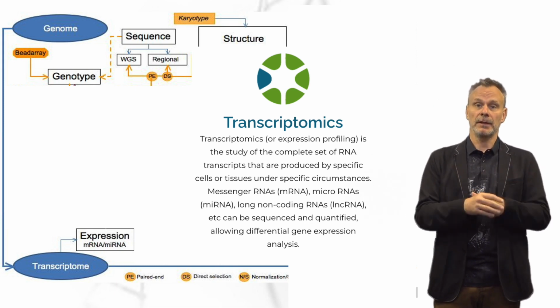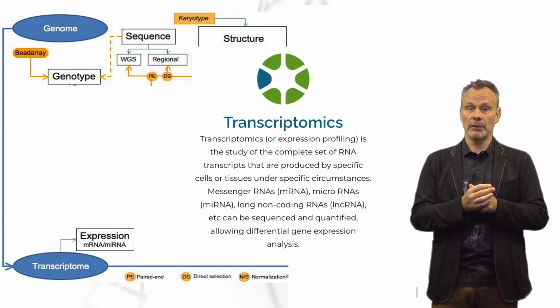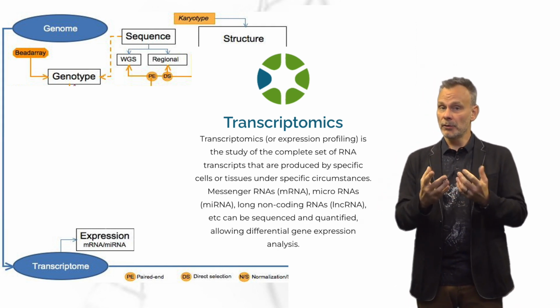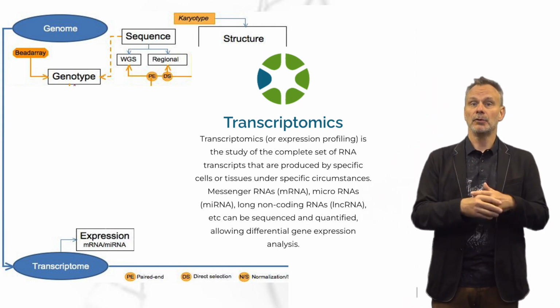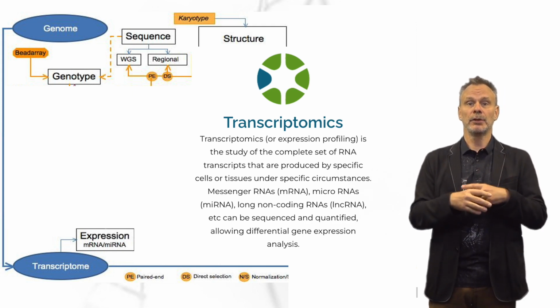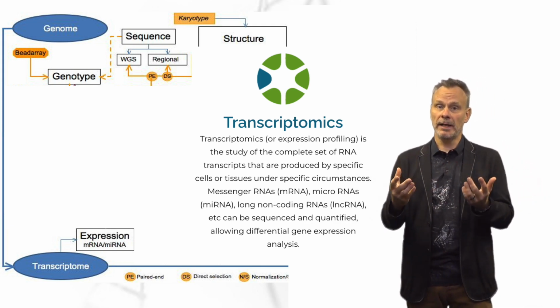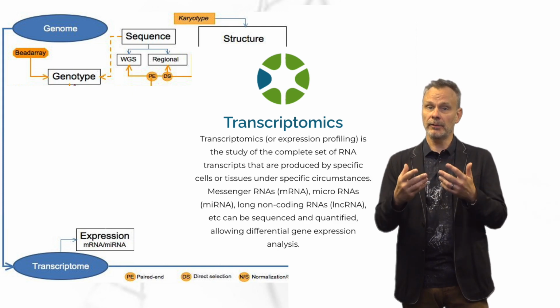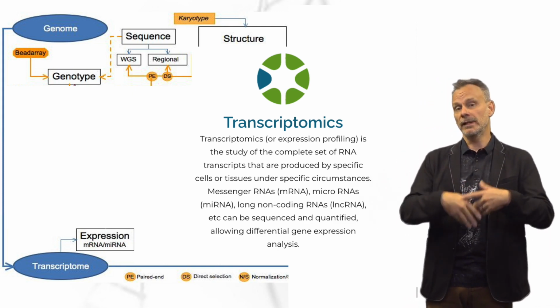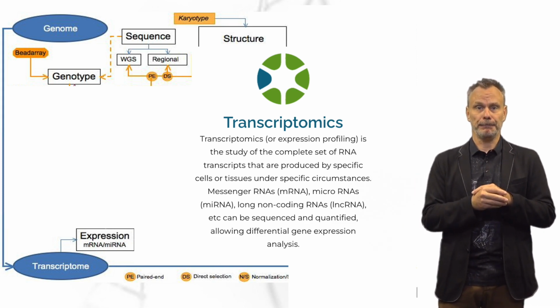again, very specific translational questions like cancer transcriptomics, where we analyze to see unique expression profiles in tumors. It can also be used, for instance, in virology to sequence RNA viruses, understand viral evolution, and understand host-virus interactions. We also have been applying these methods to identify integration sites when viruses integrate in the host genome to see if they disrupt essential components of the host defense.